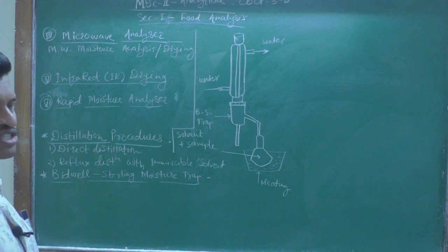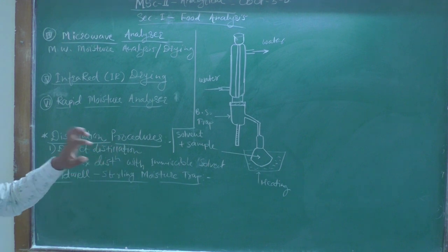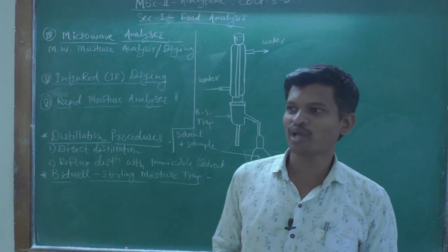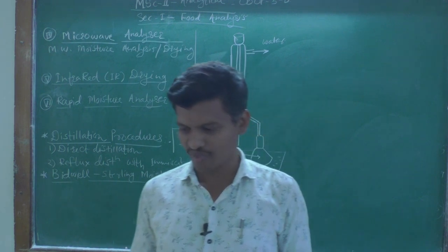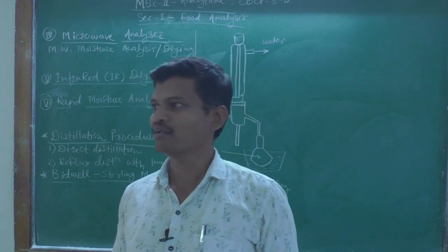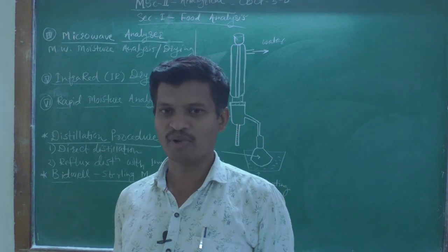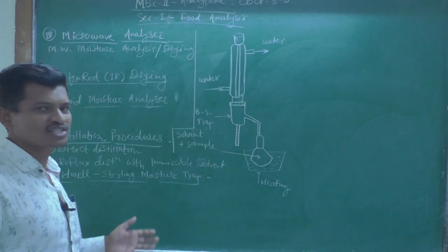Now the next procedures for moisture analysis are dependent on distillation procedures. So what is distillation? We are boiling our solvent, and at the boiling point of that solvent or liquid, we are distilling that sample with the help of heating. So it is called the distillation process.